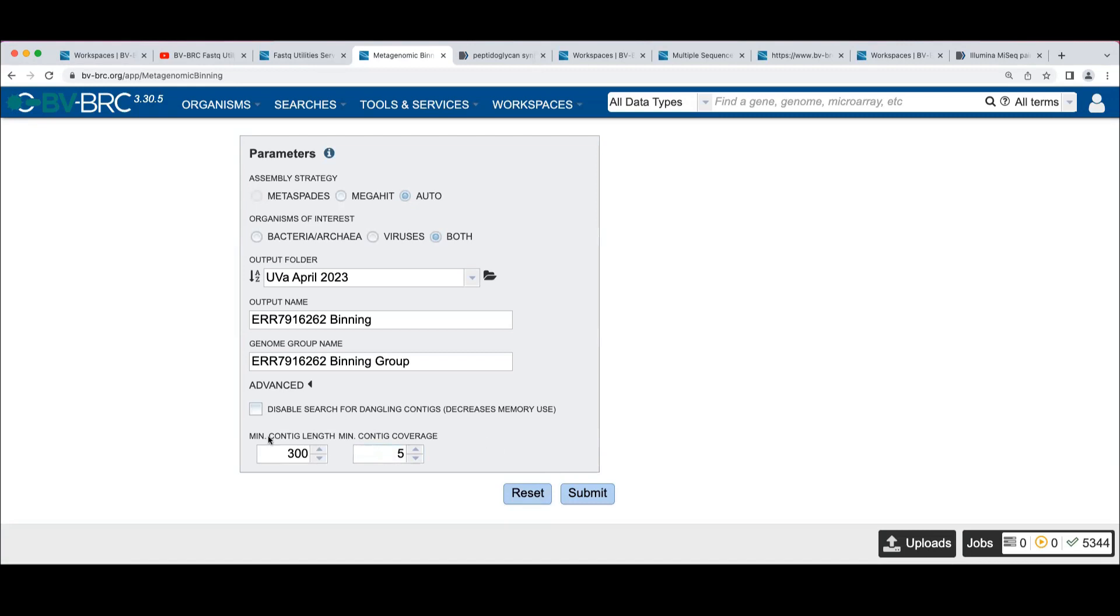So if you're interested in tinkering with that, you can change those values. But we default to pretty reasonable values here.